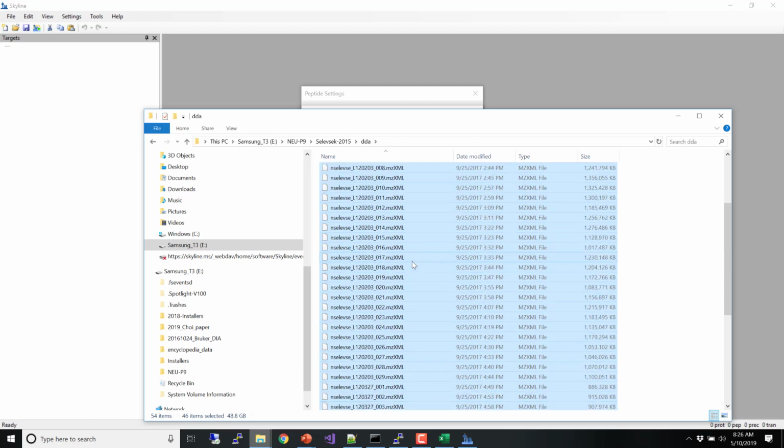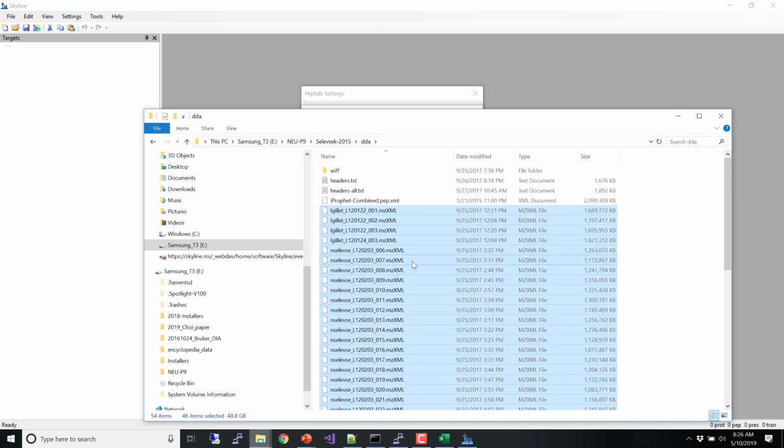So this is this fractionated thing, hoping to give them the widest possible set of things that they have seen that they are willing to look for in DIA. But you can see, let's see, what does it say? Yeah, so this itself, if I were trying to give this to you, it'd be 50 gigabytes.